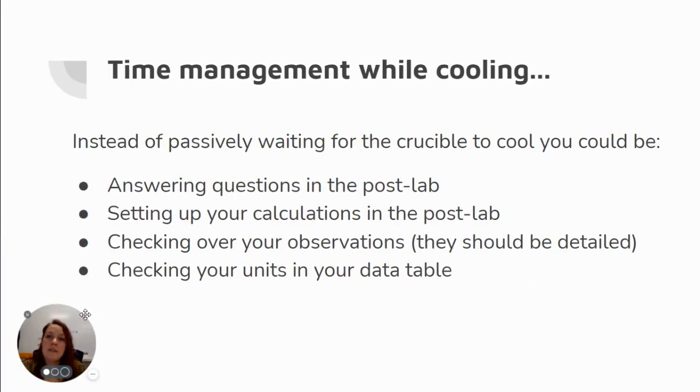So the last note I want to leave you with is you really need to make sure you are taking advantage of the time that you have in class. While you're waiting for your sample to cool, you should be actively working on questions in the PostLab, calculations in the PostLab, or at least putting the skeleton setups for them, checking over your observations and trading observations with your partner, checking your units in the data table. There are so many other things that you can be working on while this is cooling.